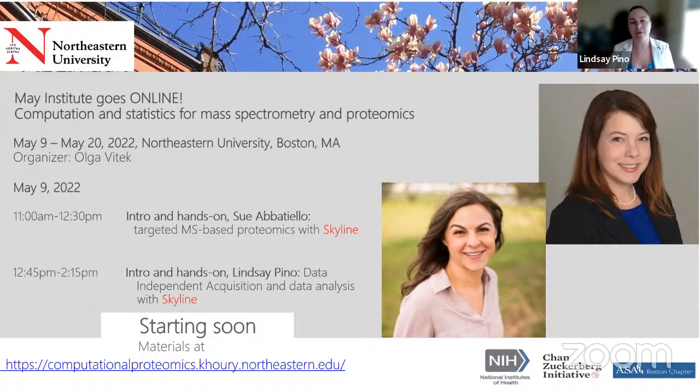It's more to be a reference for you, so that as you go either into proteomics or more in depth into proteomics, these aren't new things that you have to Google. You'll be like, oh yeah, I vaguely remember someone mentioning that and it was a quantitative technique. That's kind of the idea.